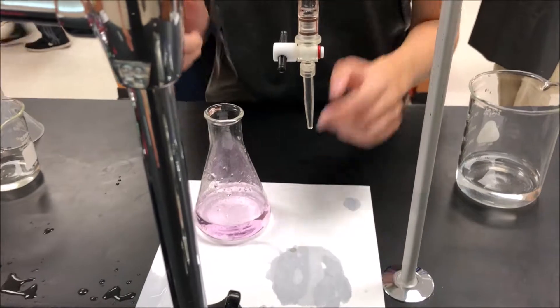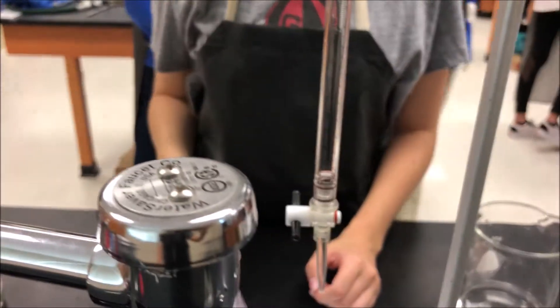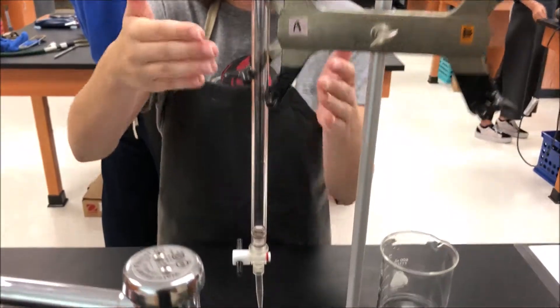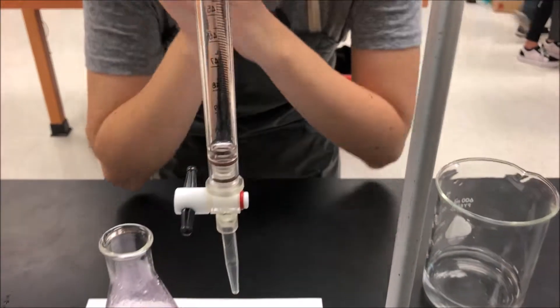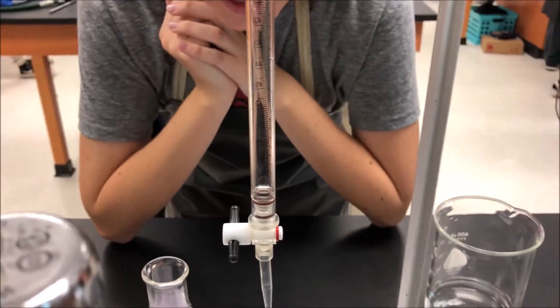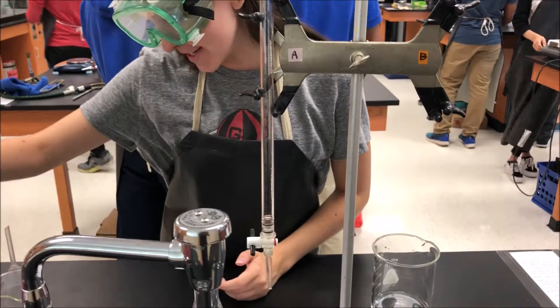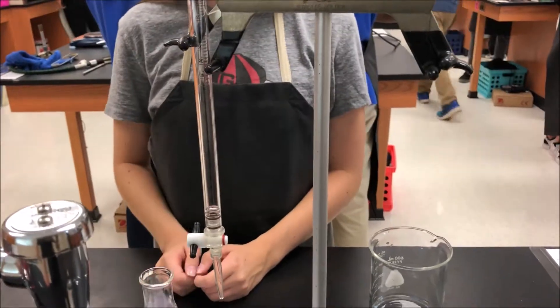You're supposed to wait 10 to 15 seconds for the liquid to drain off of the burette. And then you're supposed to read the volume, which is going to be right under 50. So it looks like we used a little over 50 milliliters of our titrant to titrate the solution.